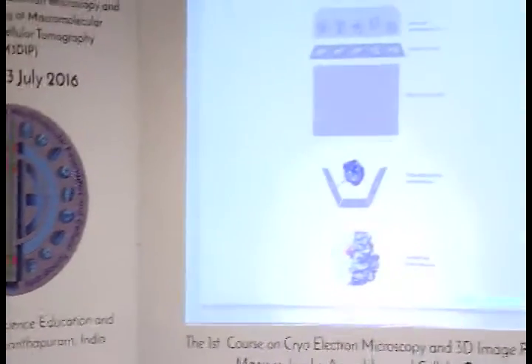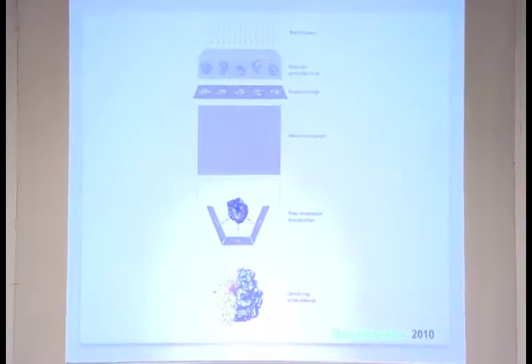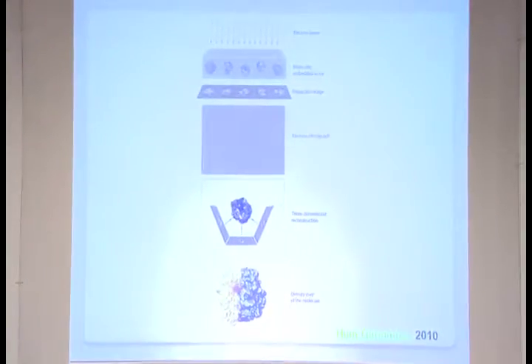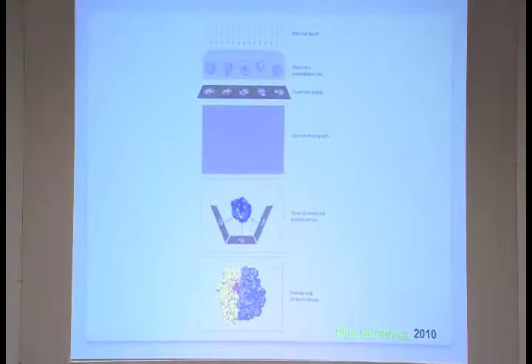I will be talking about this flexible fitting into cryo-EM map. So far you have already learned all the techniques exhaustively, I believe, to get a cryo-EM 3D map. Maybe 5 years back I could safely say a medium resolution cryo-EM map. But today I can't say that, because many people will say, no, we get atomic resolution.